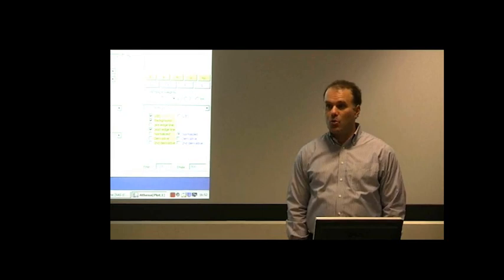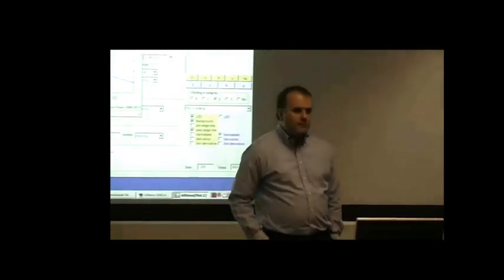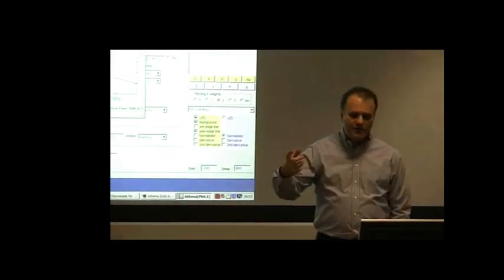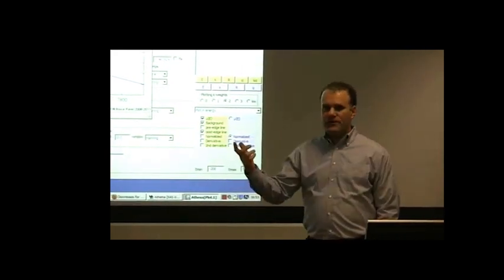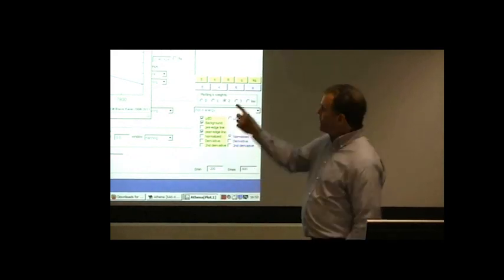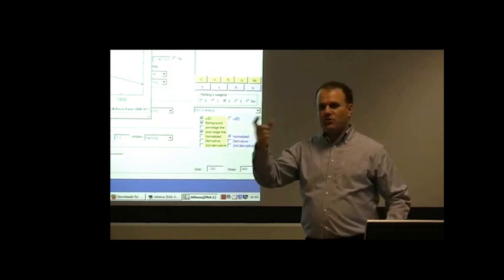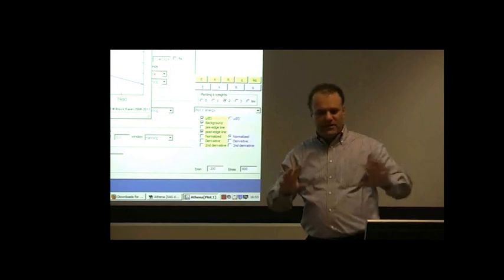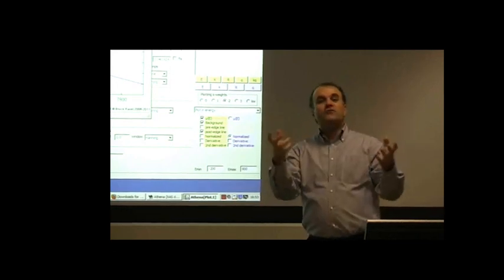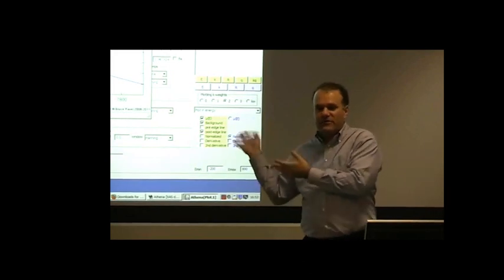So what I would recommend in this case is you could get yourself a jar of, iron isn't the best choice for this, but I'm going to say it anyway. So you can get yourself a jar of metallic iron powder, and the problem there is that it won't stay metallic, but details. You can do this with platinum, right? You could make something that doesn't oxidize. What I'm suggesting works exactly. Something that does oxidize, you have to think a little bit better about it.